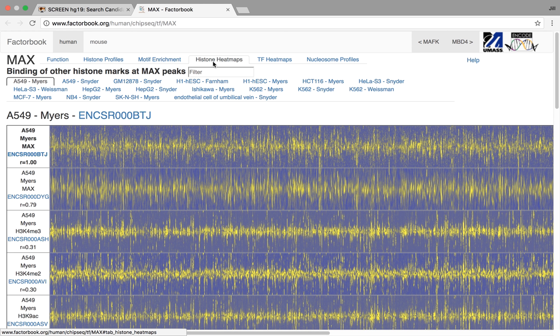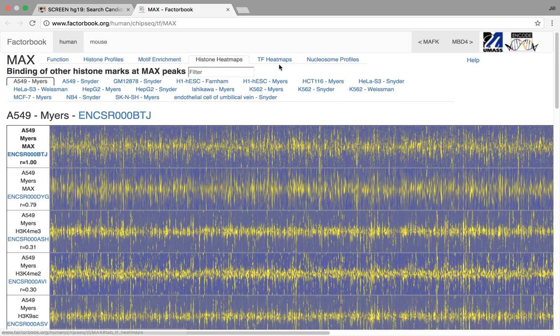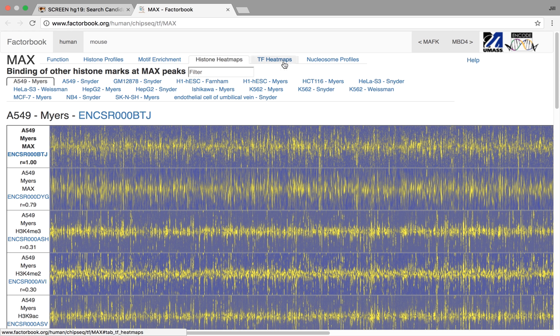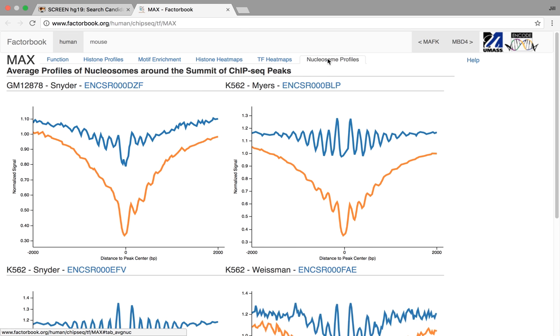We've also built heat maps around all of these ChIP-seq TF peaks. Here the columns are a ChIP-seq TF peak, and the signal here is the histone mark signal in a 10KB window, and for other TFs in a plus minus 2KB window. And last but not least, we also have some nucleosome positioning data for this particular TF.